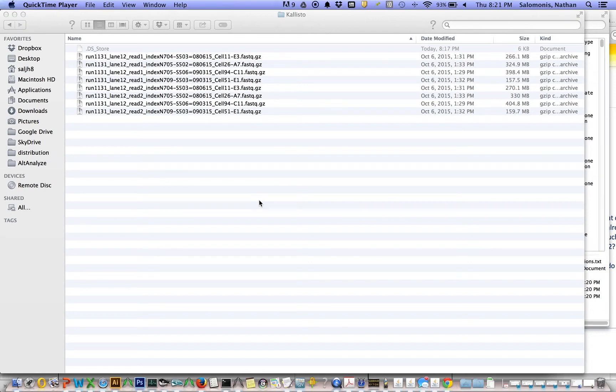Welcome to this brief tutorial on how you can analyze raw sequence data, in particular FASTQ files, in AltAnalyze using the Kallisto algorithm produced by Lior Pachter's group.